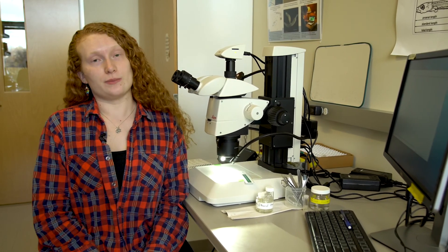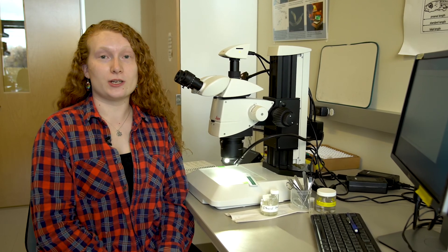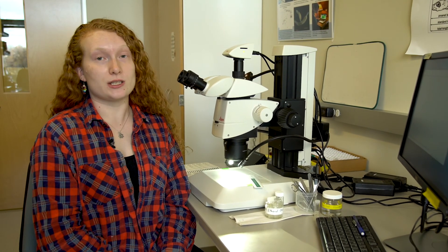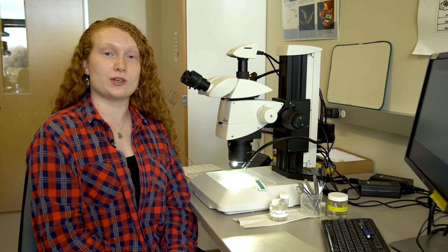So using the identifiers I described to you in this video, we will identify your ichthyoplankton as specifically as possible and send the information back to you so you can complete your study.